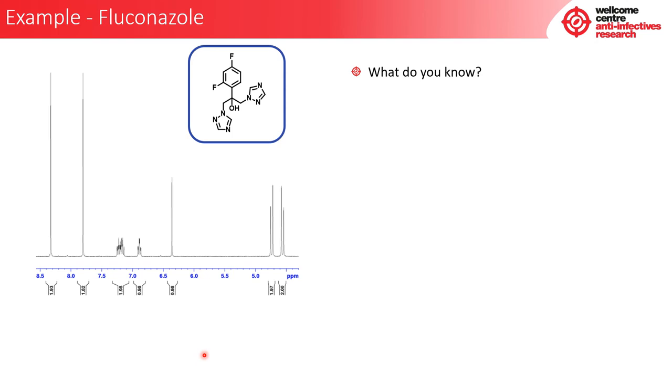So first of all, we want to be able to understand how many protons add up to each one of the signals. And this is known as integration. Where can we find integration? Integration are the numbers that are present below the spectra that you can see here. What we do is we start to round to the nearest whole number to determine how many protons are making up that signal. So we've taken this one peak here, which has a value of 1.93. If we were to round this number up, it's 2. So we can therefore say that 2 protons are equating to this signal.